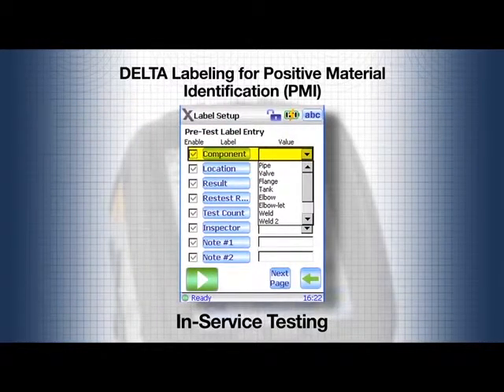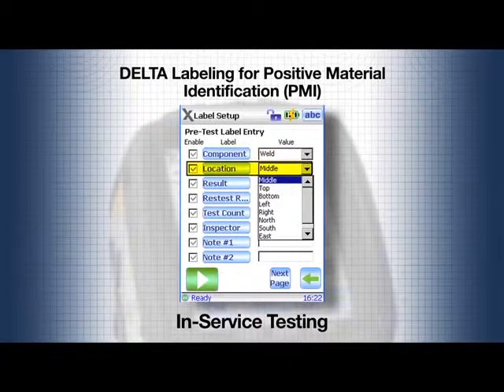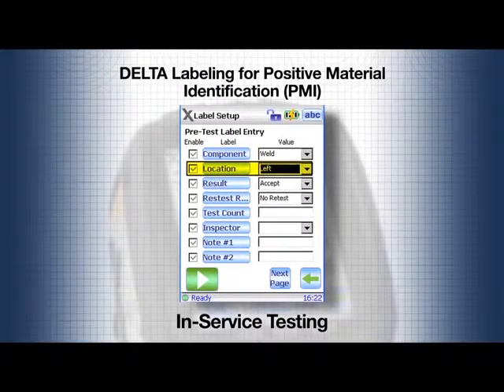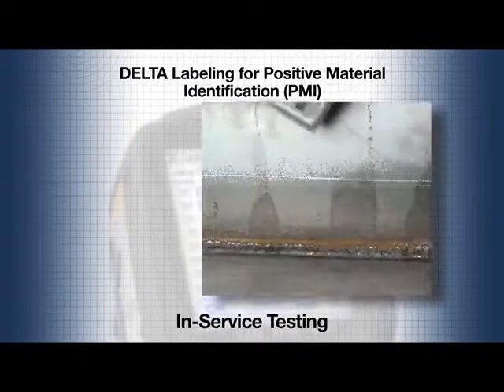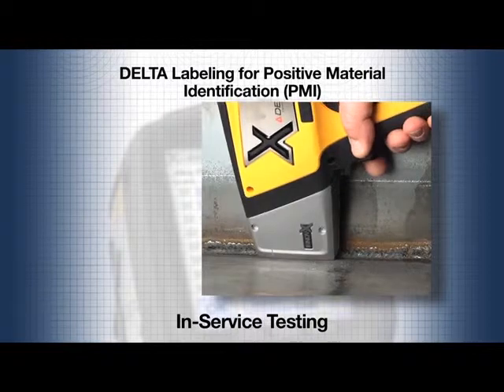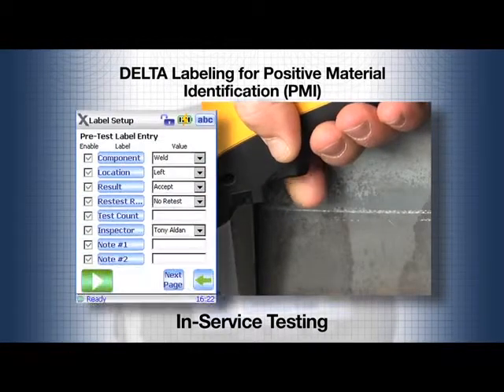Select the component and the location on the component where the first test will be run. The result field defaults to accept, but if the test needs to be rerun, this field can be changed to retest after the test is taken. Place the analyzer on the sample, pull the trigger, and the test begins.